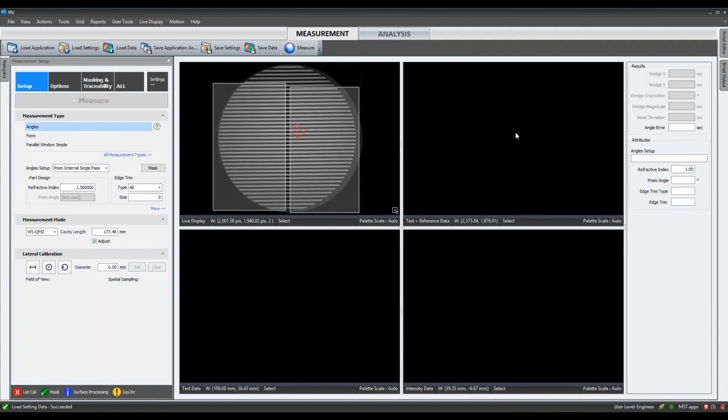All right, so there's a handful of other features that will be coming with MX 8.0, changes to both the form and MST applications, the analysis flow, lots of other UI improvements and consistency changes, as well as new scripting commands and profiler improvements. So keep an eye out on the website and on the upcoming events as we cover those in the future.